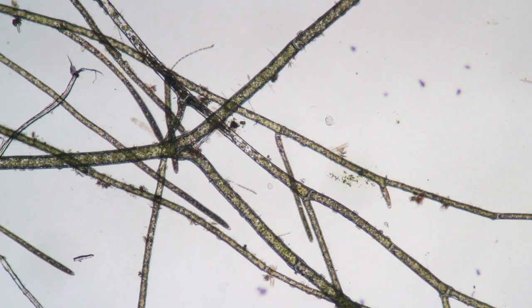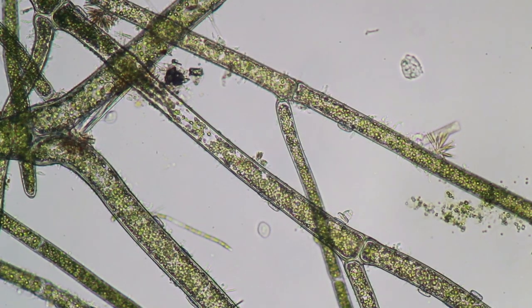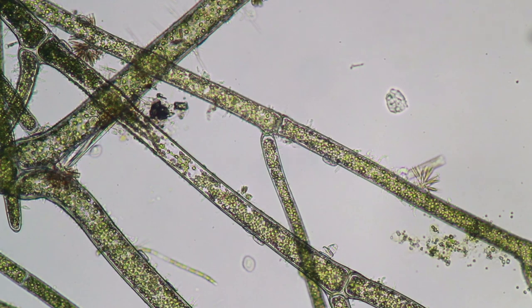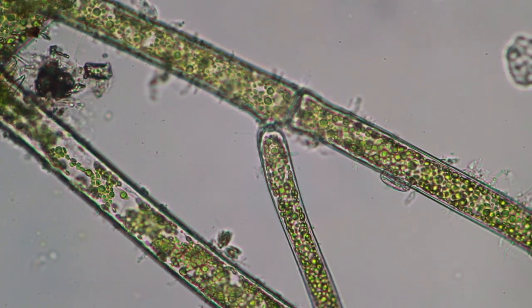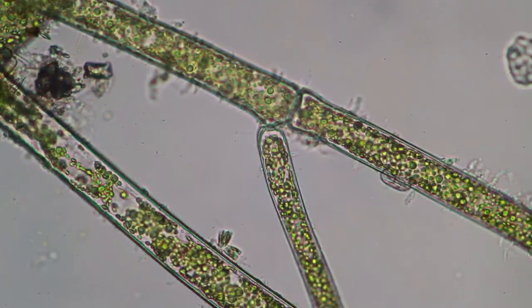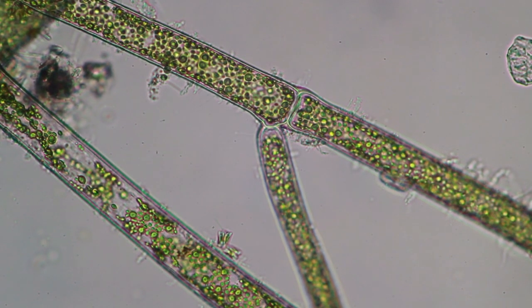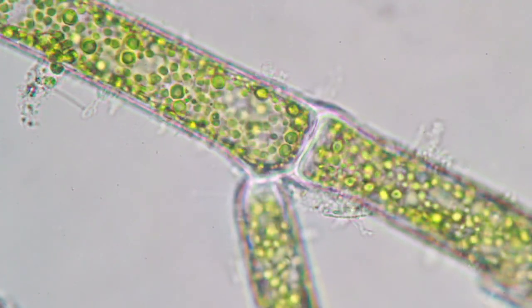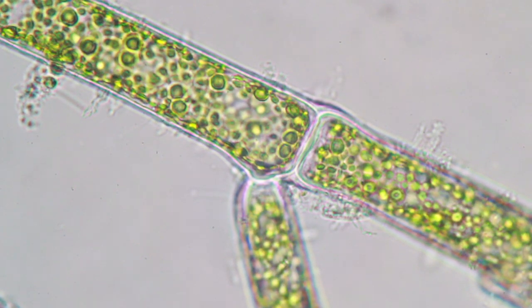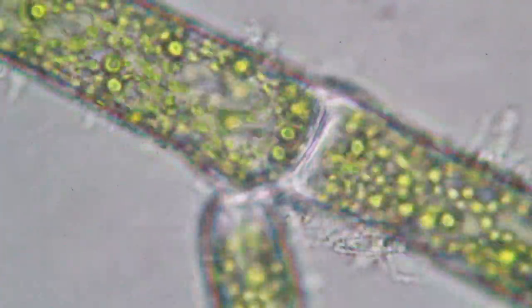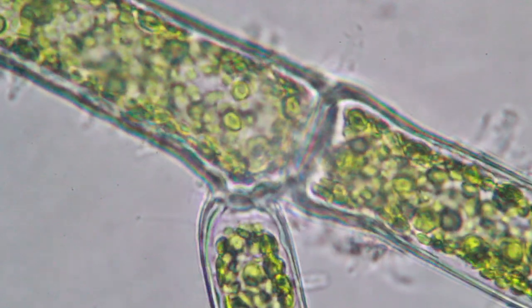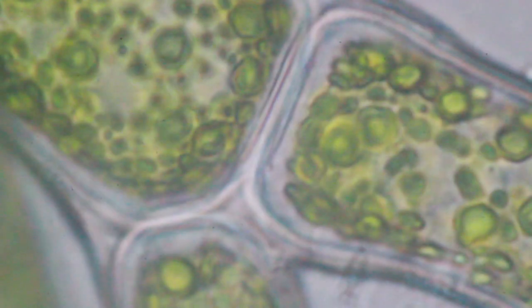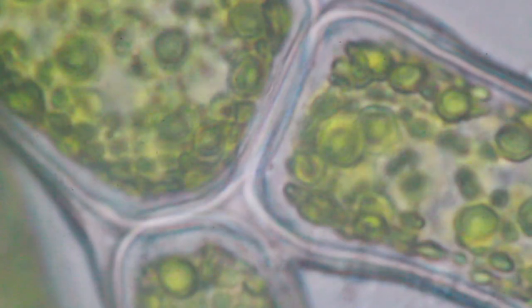This is basically looking at it using the 4 times magnification, so the total magnification when you look through is 40 times. This is using my 10 times objective, you can already see the individual green chloroplasts in the cells. 20 times objective, I have also a 20 times objective, I like this a lot, I use it quite frequently. 40 times high power objective. This is now 60 times, I use this one quite frequently actually, and you can see the chloroplasts quite well.